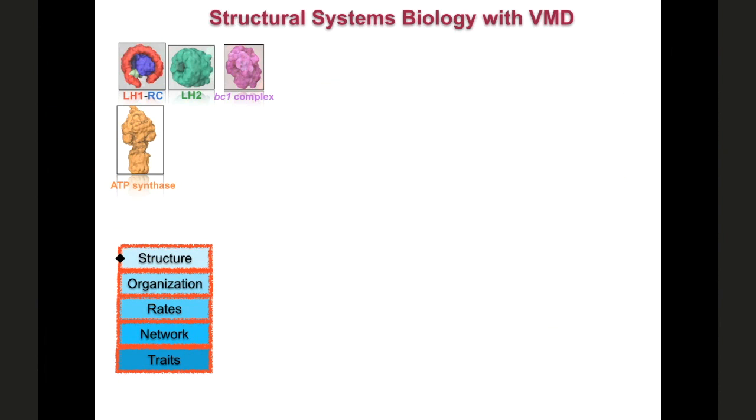Biology is not about individual proteins. Biology is in fact about how these proteins work with each other, how they coordinate, how they combine with each other. So let me give you a workflow of what we call structural systems biology, and then take you to places where VMD comes in. So what do we do in structural systems biology? We take a bunch of proteins.